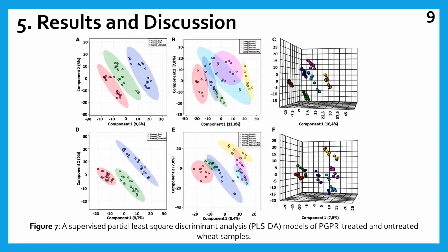So it was also observed that the metabolic profiles of the rhizosphere change over time as well. In the figure, that's Figure 7B and E, we are able to track the metabolic changes of the different cultivars over time. The changes over time essentially represent how the rhizosphere itself changes in terms of metabolic composition or profiles over time. That is more or less expected, as bacteria growing in an environment will keep on secreting different kinds of compounds over time. The same applies with plants, essentially. As plants grow and develop, they'll produce different kinds of metabolites over time.